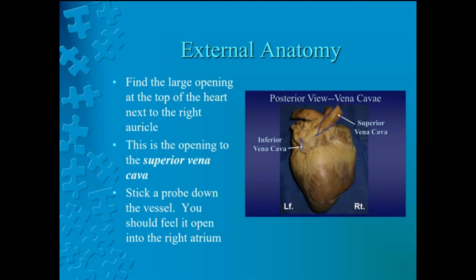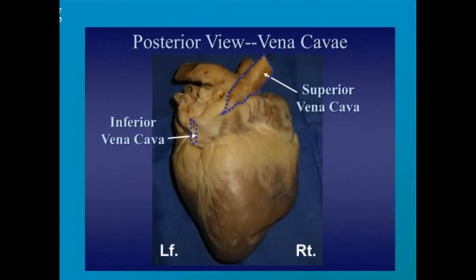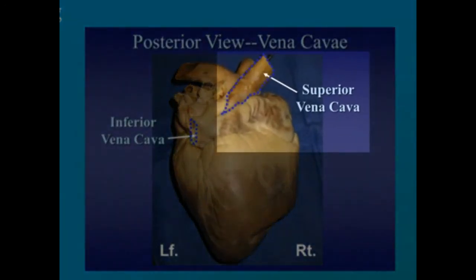Now place your heart in its original position with the left atrium and ventricle in your right hand. Locate the large opening at the top of the heart next to the right auricle. This opening is the superior vena cava. The superior vena cava brings blood from the top half of the body to the right atrium. At this time, stick a probe or your finger down the vessel and you should feel it open into the right atrium. Pause to let everyone locate the superior vena cava.